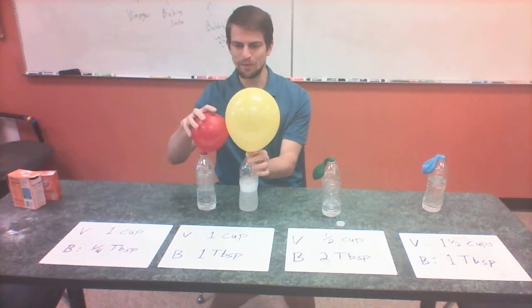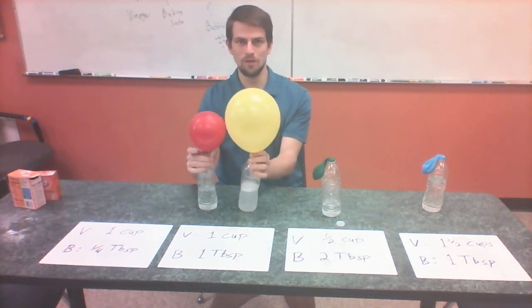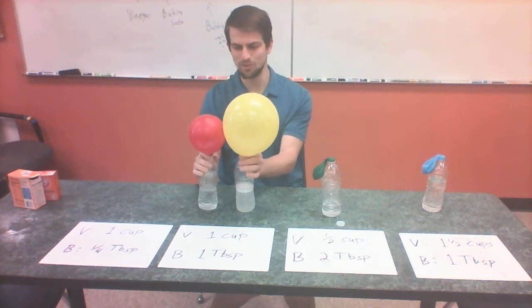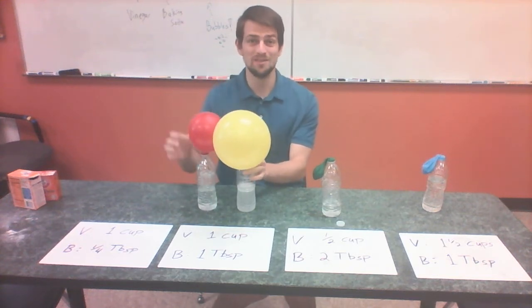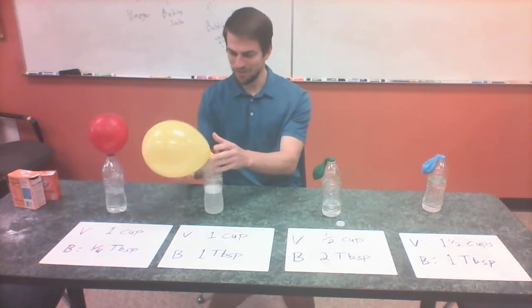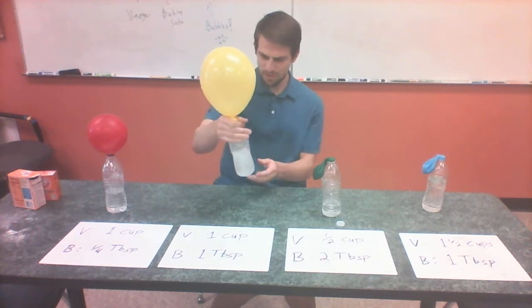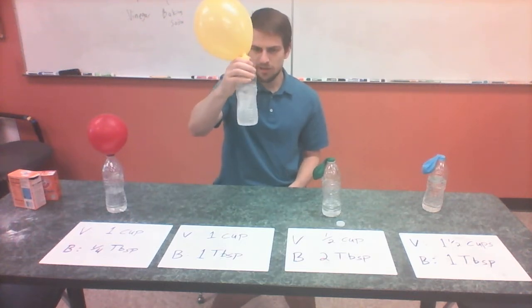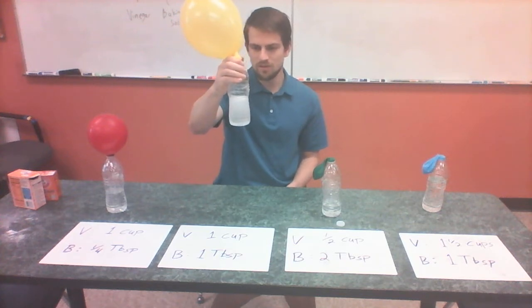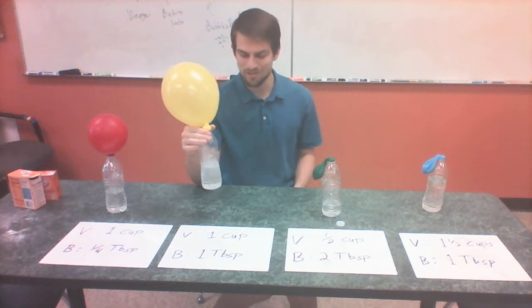If you look at the amount of air that would be in here versus the amount of air in here, the one looks like it would, in fact, maybe be 4 times as much. My geometry students could tell you it's because it has about twice the diameter. But you have to wait till geometry to learn about all that. So I'm going to swirl this up, make sure everything is reacted. And it's looking like this is pretty clear as well. It looks like maybe baking soda was still the limiting reactant. But we can test other values to see if that was indeed the case.